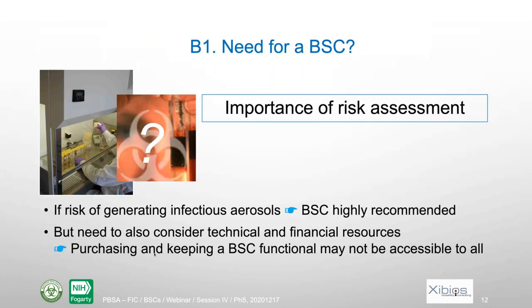The second chapter is about the need or not of a biosafety cabinet. And there I really want to point out the importance of risk assessment. We need to assess the need, and that's mainly assessing the risk. If there is a risk of generating infectious aerosols and those aerosols are likely to infect the people in the lab, in that case, a biosafety cabinet is highly recommended.